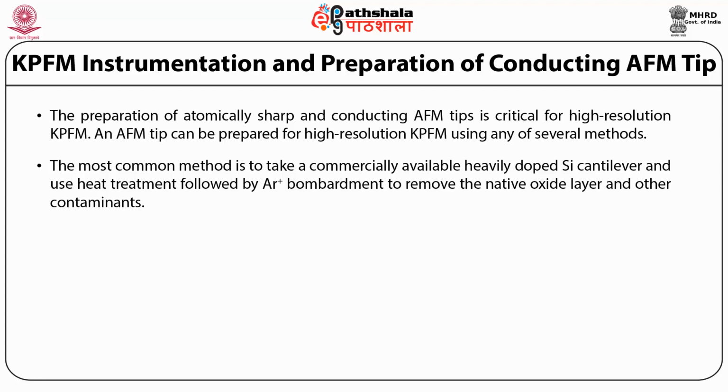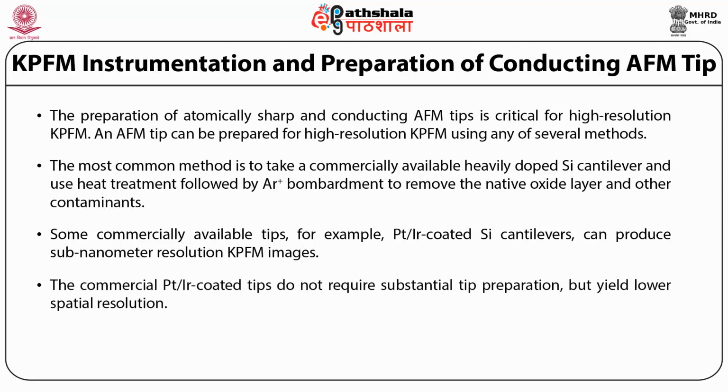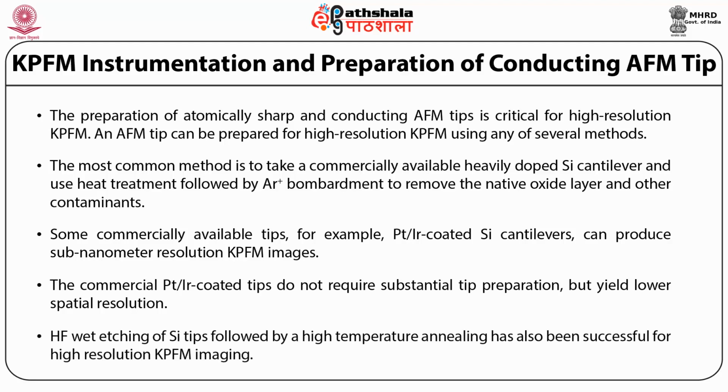The other method is some commercially available tips, for example, platinum iridium coated silicon cantilever, which can produce sub-nanometer resolution of KPFM images. The commercial platinum iridium coated tips do not require substantial tip preparation, but yield low spatial resolution. We can also use HF wet etching of silicon tip followed by high temperature annealing, which has also been successful for high resolution KPFM images.